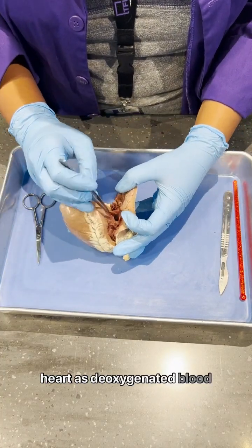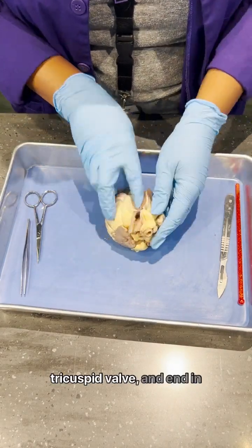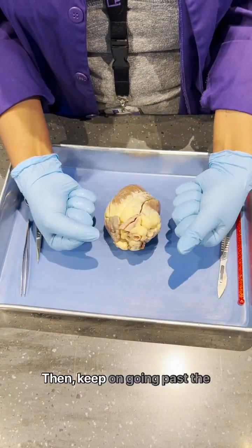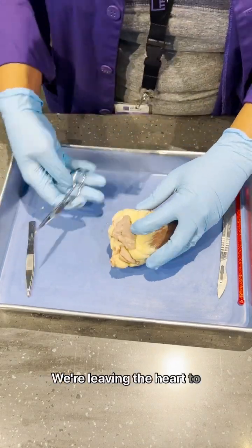We're going to enter the heart as deoxygenated blood from the vena cava, go past the right atrium, past our tricuspid valve and end in our right ventricle, then keep on going past the pulmonic valve and out the pulmonary artery. We're leaving the heart to get some oxygen.